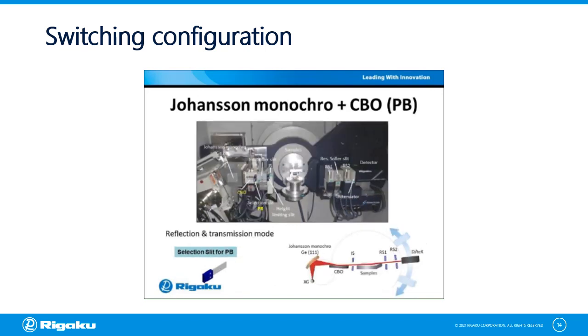In the past, the biggest drawback to using a Johansson monochromator has been the severe limitations that the configuration places on a powder diffractometer. Most diffractometers that are configured to do K-alpha-1 data collection cannot be easily switched to a standard K-alpha-1, K-alpha-2 data collection mode. The subsequent alignment is too difficult to undertake without factory-trained engineers present, if the system can be reconfigured at all.